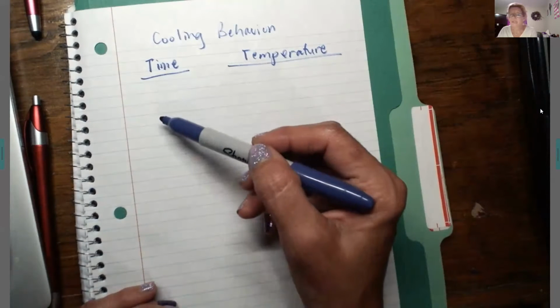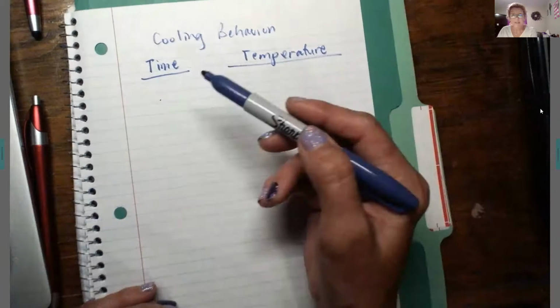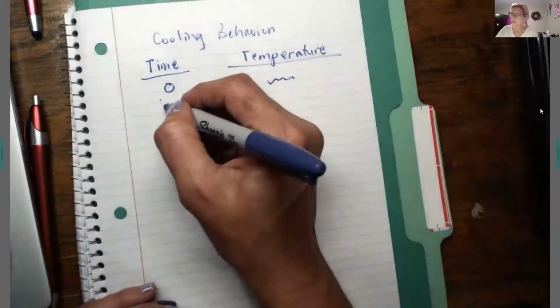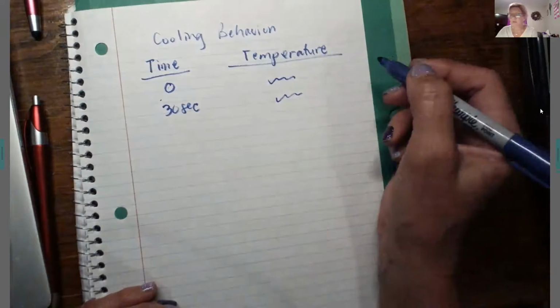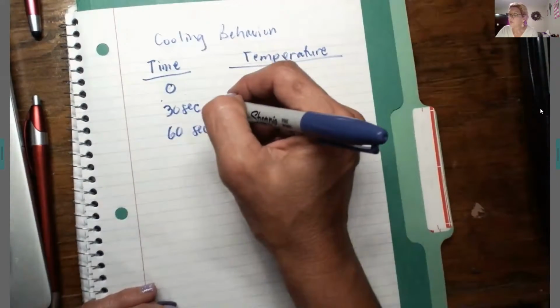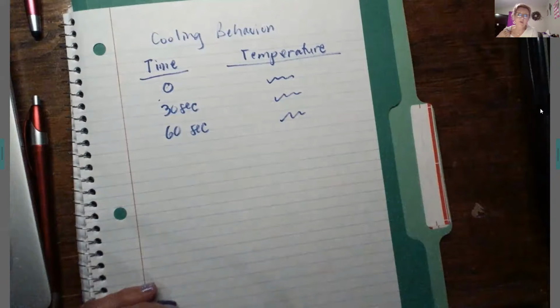We have somebody reading the temperature on the thermometer, and you can do it by yourself, and then taking the time every 30 seconds. So at 0, you will write down what the temperature is. And then at 30 seconds, you're going to write down what the temperature is. And then at 60 seconds, you're going to write down what the temperature is. So let's just do it. We're going to be having to graph it in minutes, because we're going to take down so much data, it won't fit on a graph.